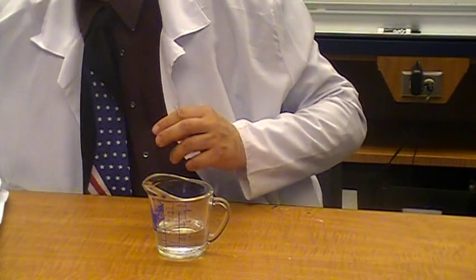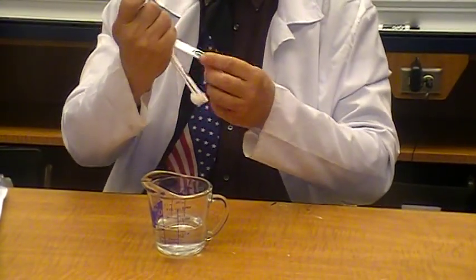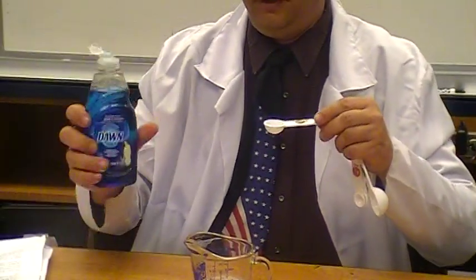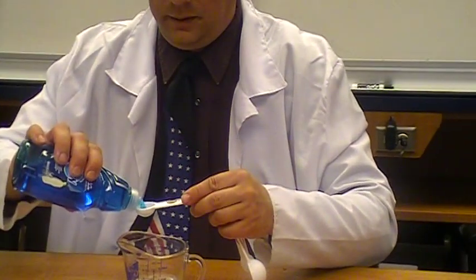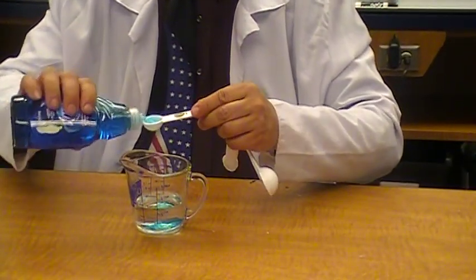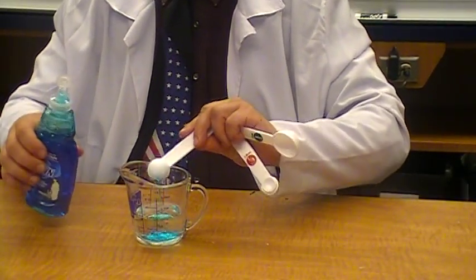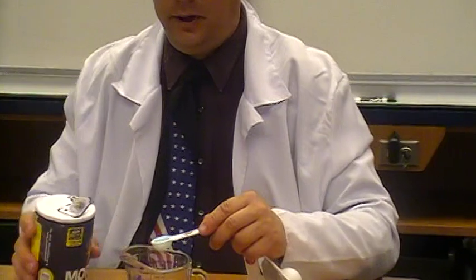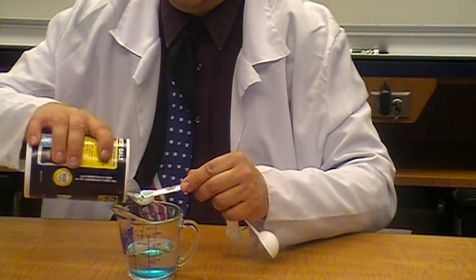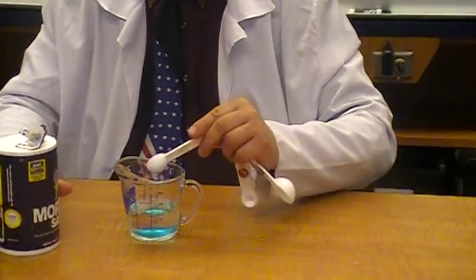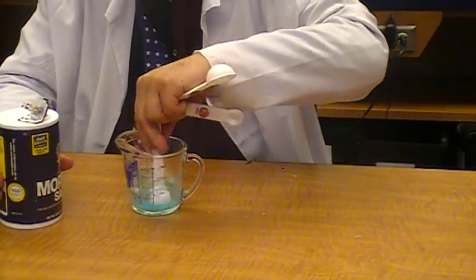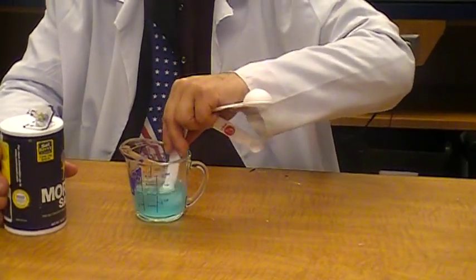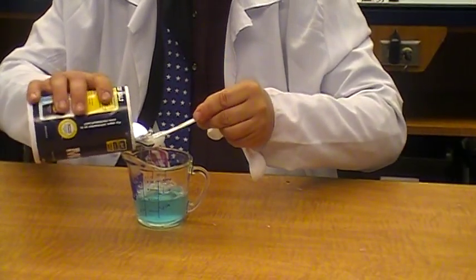And I'm going to add to that a teaspoon of soap. I have found that Dawn dishwashing soap tends to work pretty well after some trial and error. One, two, just like that. And I'm going to put in about a half a teaspoon of salt to help match the osmolarity of the strawberry guts that Alex is still smashing up over there. And let's stir it all together.